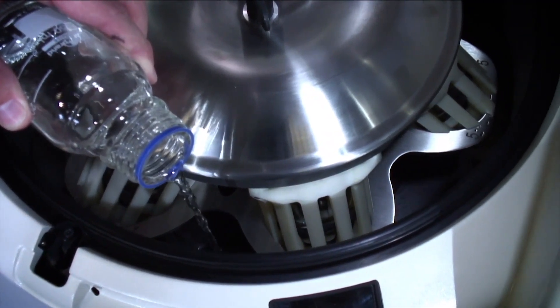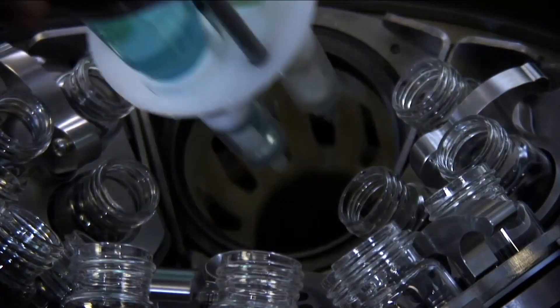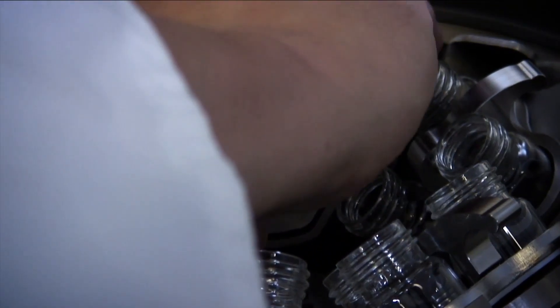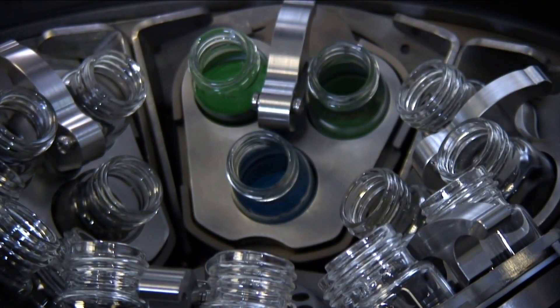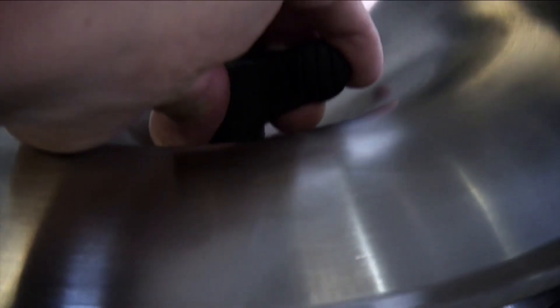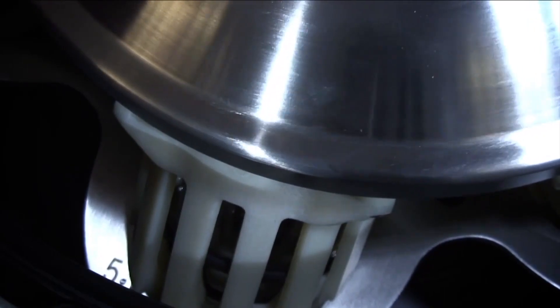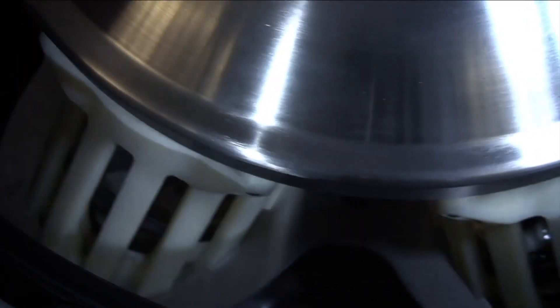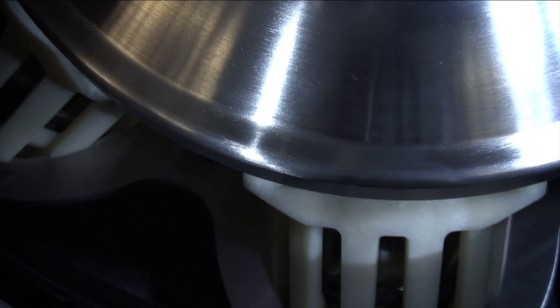To ensure safety, the steam is at low pressure and low temperature. The flasks or vials are sealed into the rotor. The body of the flask is exposed to the steam but the mouth is kept separate in the inner chamber. Vapors exhaust to the cold trap via the center of the rotor.